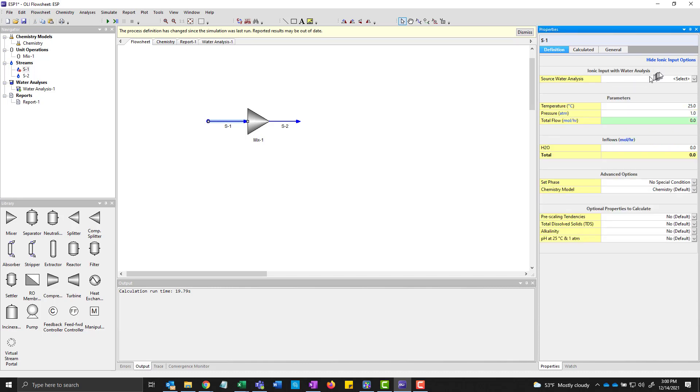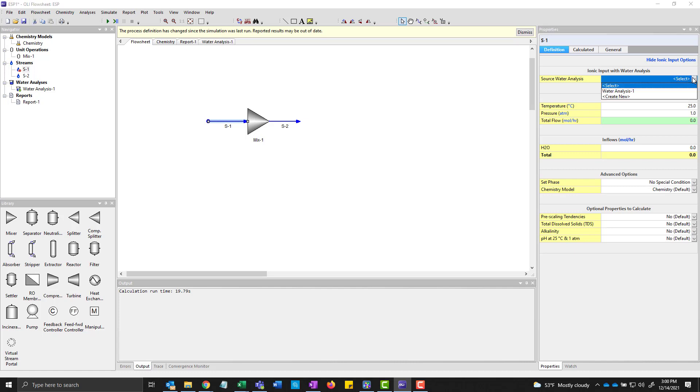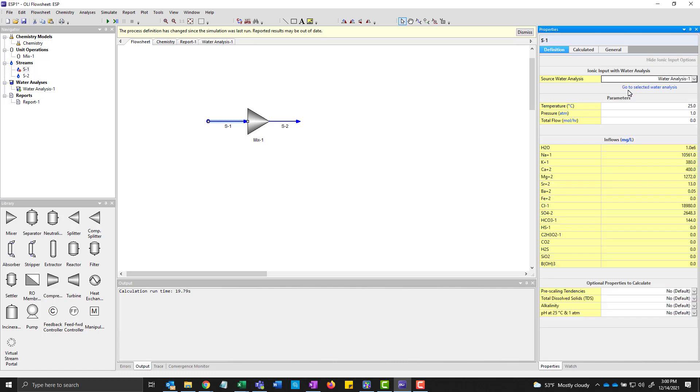Now I could have started here, but I wanted to show you the water analysis to start with. And here, I'll just click that button. And what's the source of the ionic input? I already have it. It's called water analysis 1. I'm going to go ahead and pick it. But you saw that there's actually ability to create a new one as well. So we can create it from here as well.